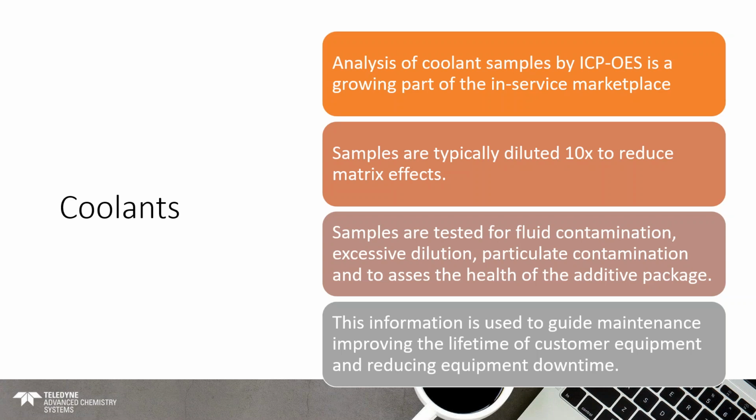Now we're going to switch gears and move over to Coolant Application. So coolants are in many ways very different. Coolant samples are typically 50% glycol or thereabouts, and they're analyzed on ICP optical instead of ICP MS. Now, we analyze the coolant samples.